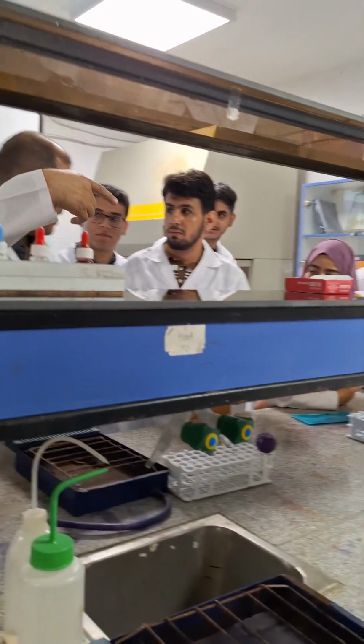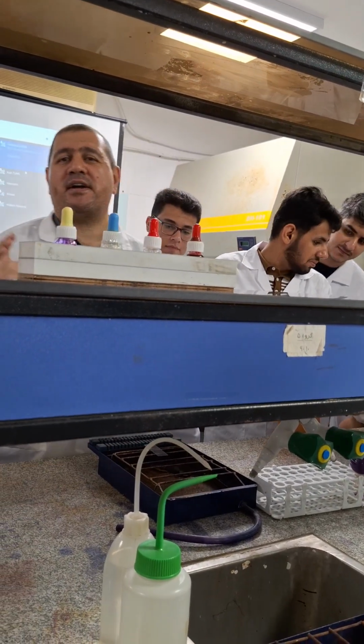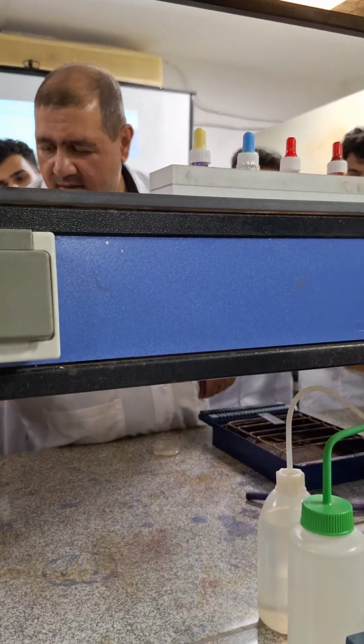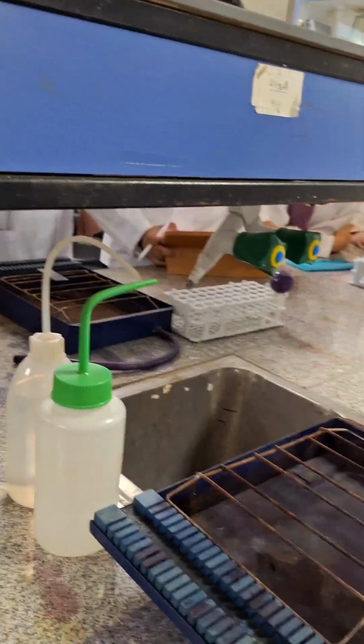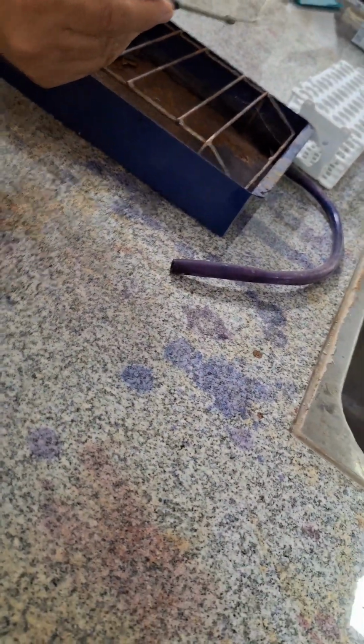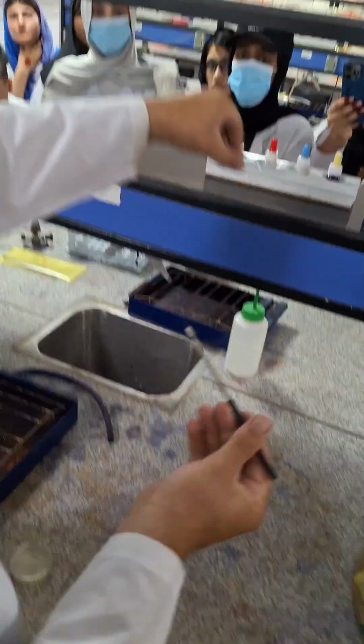To prepare a smear from solid media, place a loop of water on your slide. Pay attention here. That is enough.